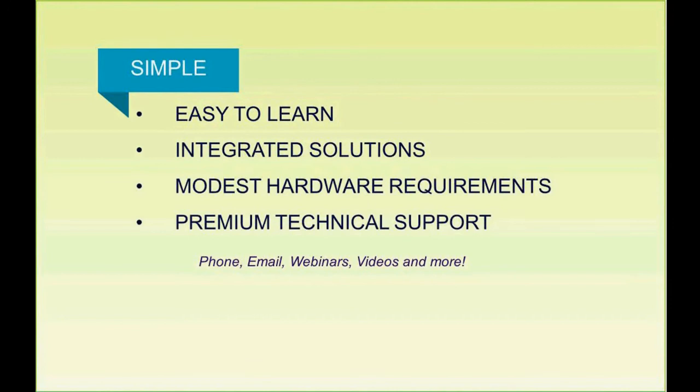Our solutions are easy to learn, logical, and developed by scientists for scientists. We focus on integrating our solutions whether by data type, workflow, or across platforms. This simplicity is evident with our modest hardware requirements and support resources and tools we have created to assist users with the software. For example, our DNASTAR Navigator interface is a helpful tool where researchers quickly find help resources at the click of a mouse.